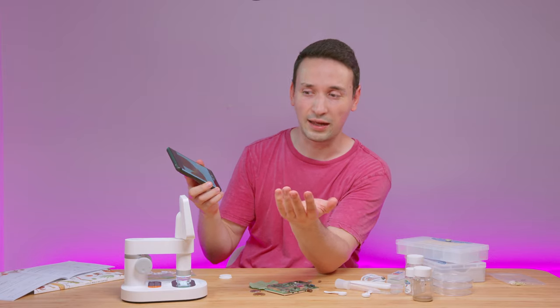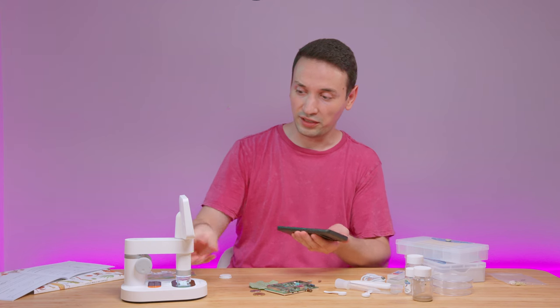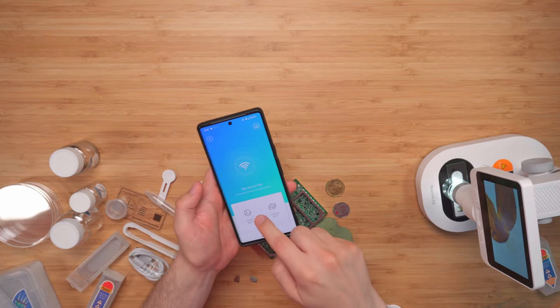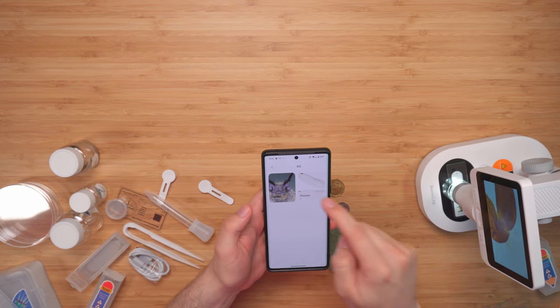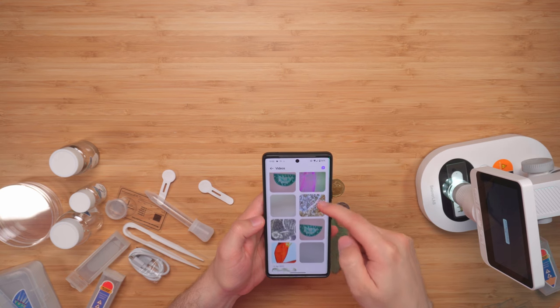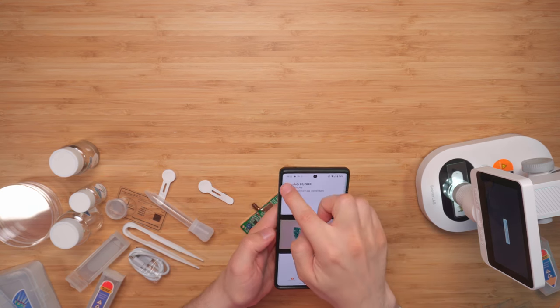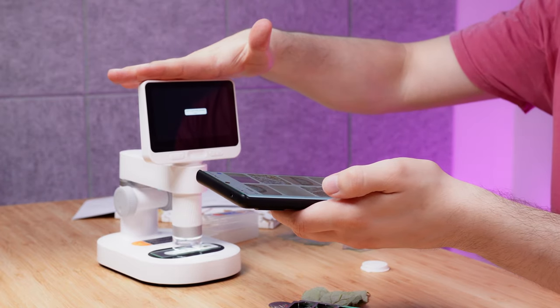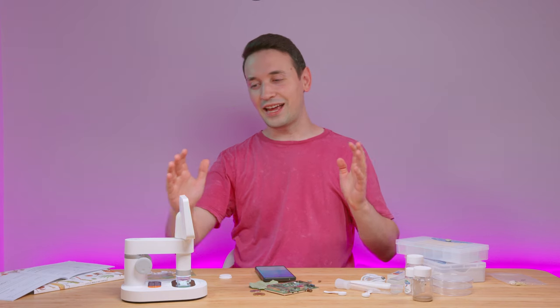You can use your smartphone or tablet as a bigger screen if you prefer. In the app you can go to the system album, view videos you've taken, download them, or watch them straight from your phone. You also have the option to do everything from the device itself — so you have two options.